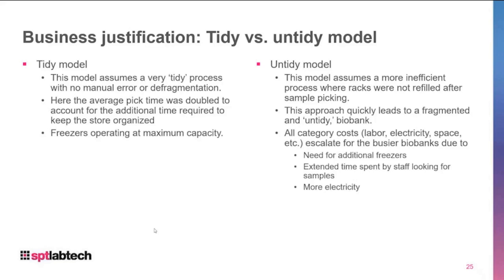The study was conducted to establish average picking time at the UK Biobank in a manual area. We showed different pieces of that workflow and how well they were organized for a manual operation. But it's still worth noting that there are some process-level questions in a manual operation.